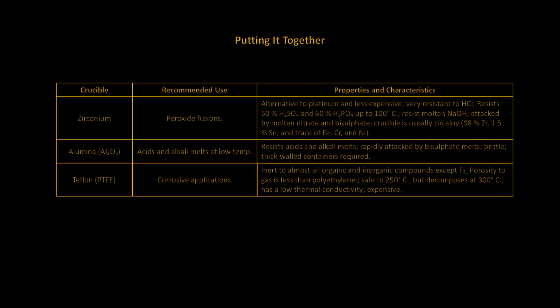Its porosity to the gas is less than polyethylene. These crucibles are only safe up to 250 degrees centigrade, and they will decompose at 300 degrees. The crucibles have low thermal conductivity. Not to mention, they're very expensive.